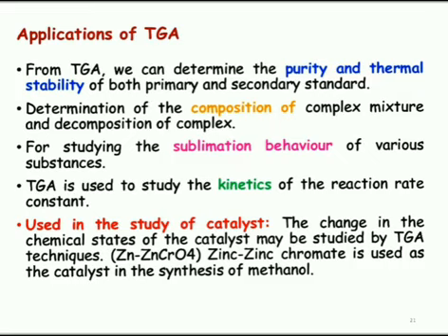So what things are present in the compound, as well as what compounds are present in a complex mixture, can also be determined by using thermogravimetric analysis.